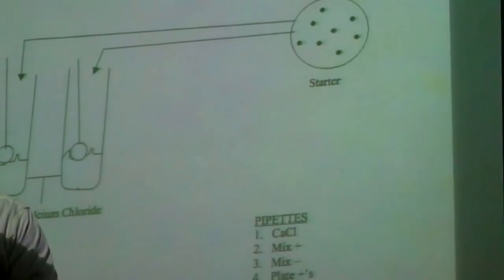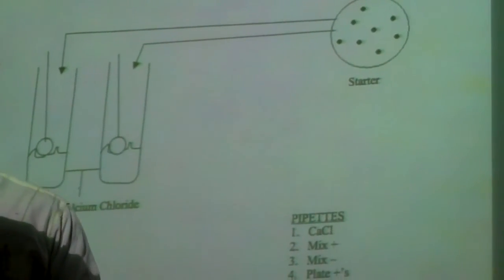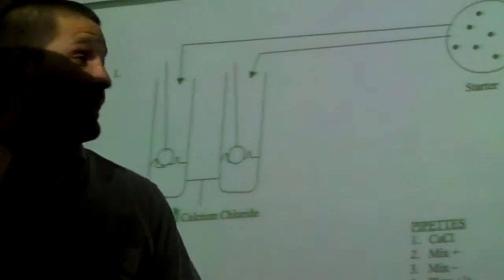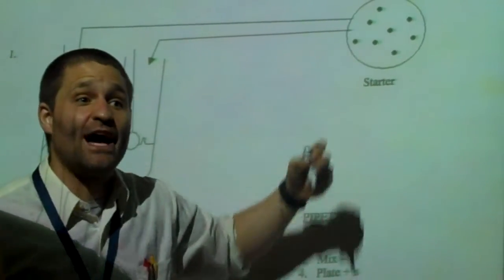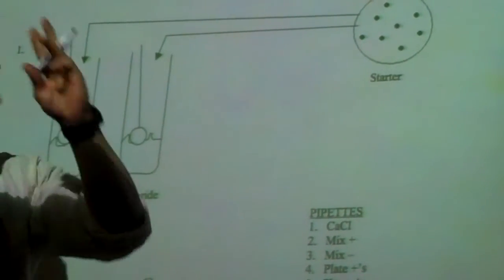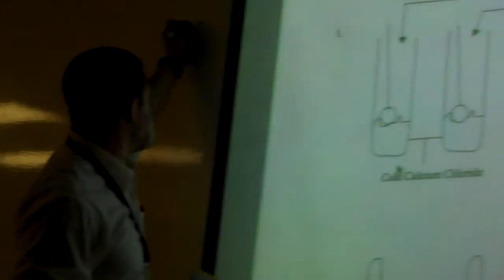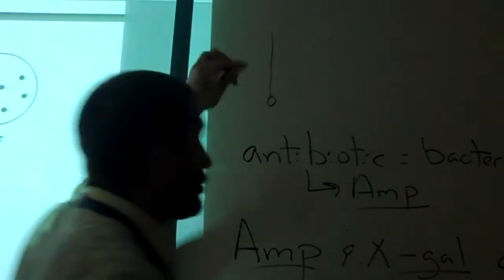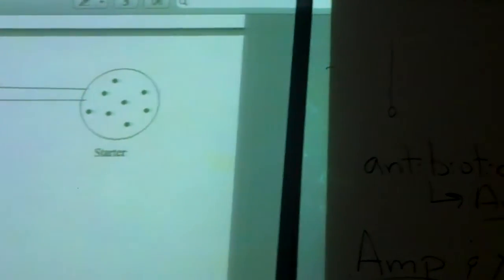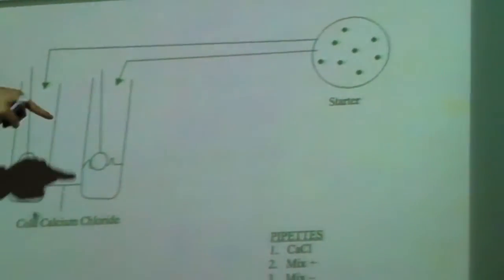So what I'm going to do this weekend is take some E. coli from the fridge and put them on some cultures. We're going to start growing that E. coli. You're going to scrape off some of that E. coli. You're going to have millions of cells. And you're going to put that on this little loop that's going to look like this. It's real tiny. Laugh at my drawing skills. It's a little inoculation loop. Think of it like how you blow bubbles, but real tiny. Got it? All right, good.